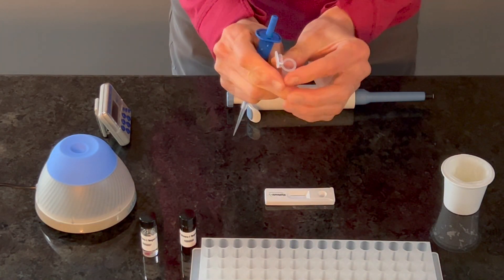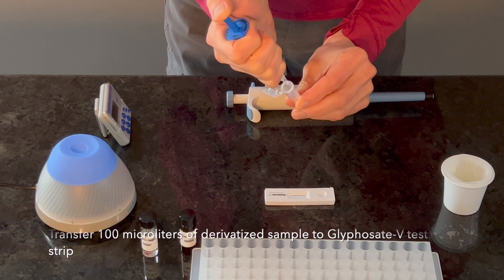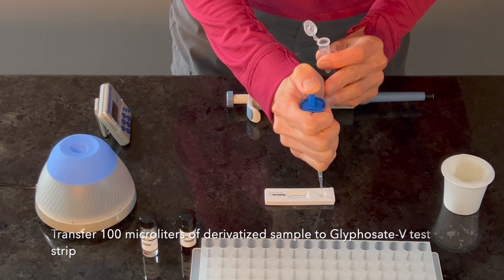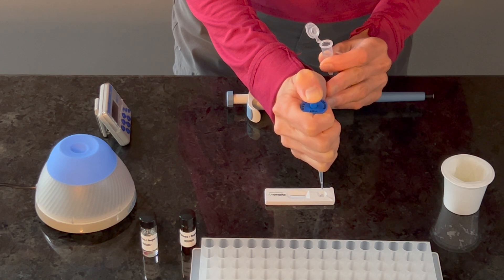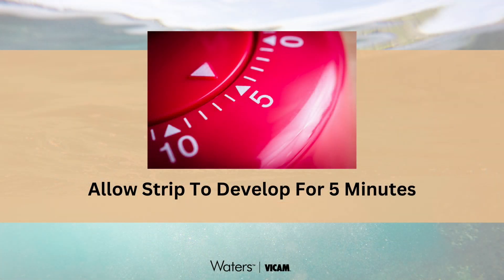Transfer 100 microliters of derivatized sample to the Glyphosate V strip by pipetting vertically into the round sample opening, allowing the sample to flow at a rate of about one drop per second. Be sure to transfer all of the sample from the pipette tip to the strip. Set a timer for 5 minutes, allowing the strip to develop on a flat surface.